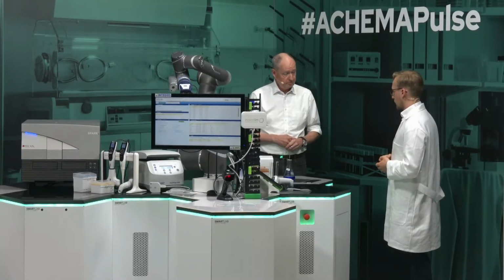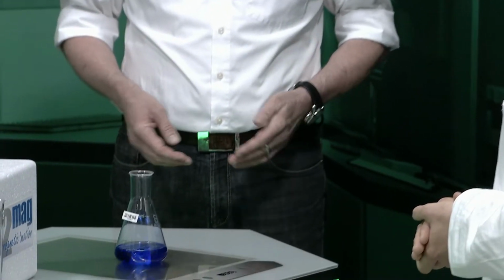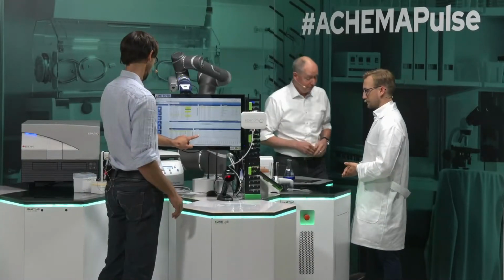Michael, I think while we were talking, the ELIMS system automatically finished the procedure, and I think our process here is done. Yeah, it's done. Do you see it indicated at the LEDs? And our analysis is finished, and I will have a look for the report. I will check it. I jump over to Robert. Michael, see you around. See you around.